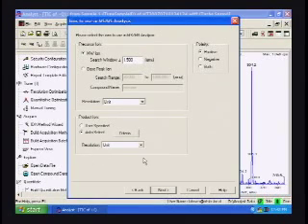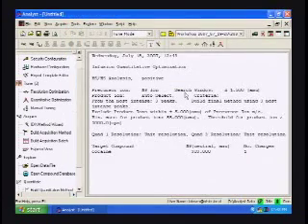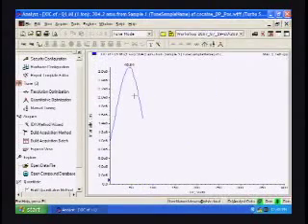This criteria is not going to change. It's going to be whatever you left it the last time, so you don't have to go back in every single time you perform this function and do it again. And this information is going to stay the same too. So we're finished. It's going to start up again. And if it tells us it's too concentrated, then we go through all this again. The intensity on that previous pane was about 9 to the 6, so it seemed to like that because we progressed.